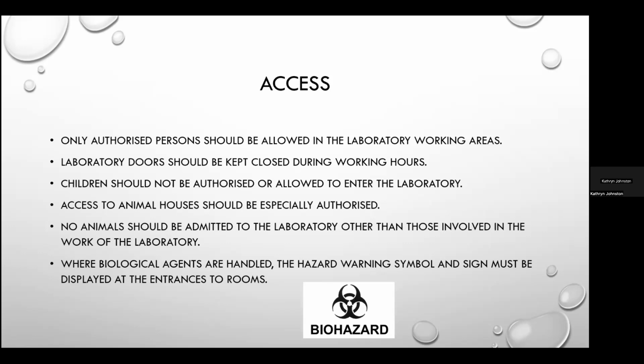So, access to the laboratory. Some of these are going to seem so common sense to you. You're going to be like, why do we even have to put them down in writing? But obviously, only authorized persons should be allowed in the laboratory working areas in order to prevent inadvertent exposures to biological hazards.